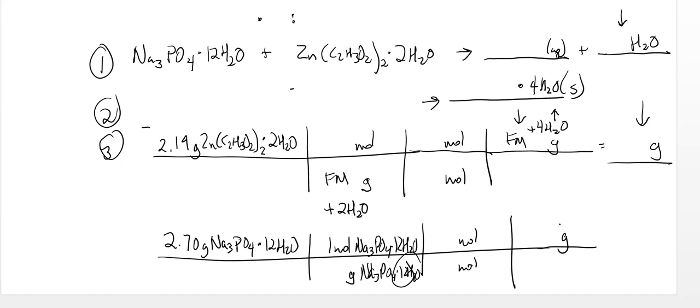Not tomorrow, because we're going to have to let this heat up, dry up overnight. This produces a lot of water. So overnight, we're going to let it sit there and produce and dry up. And then on Friday, we will get our final measurement.